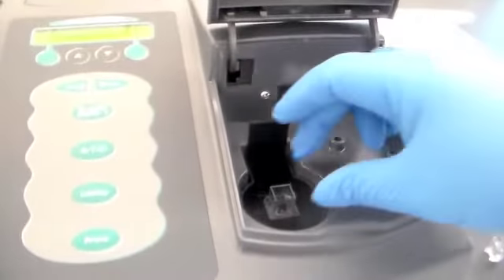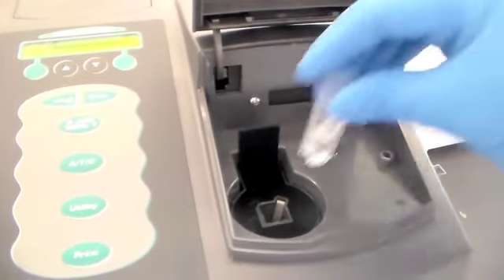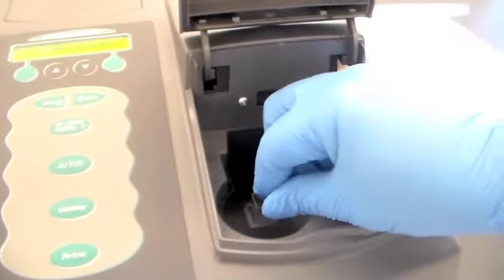So you can now take that blank out and insert your culture. Close that up. You don't have to hit anything else. It will automatically read the absorbance. This is my time 0, so I didn't expect very much absorbance, and I don't have very much absorbance, 0.002.